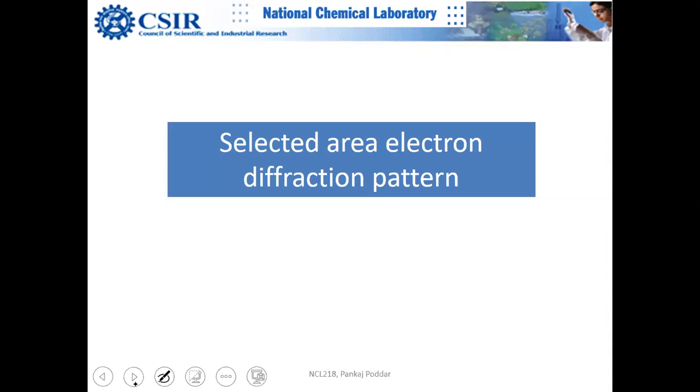So that's the end of HAADF STEM. If you have any question, then we'll go to the next serious thing, selected area electron diffraction, which is used a lot at NCL. It's the most used technique. If you have any question, please ask me. Any question?